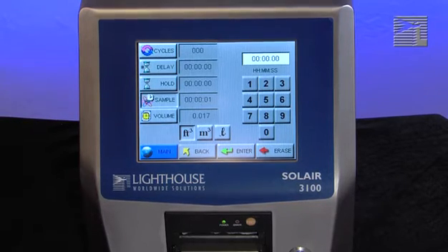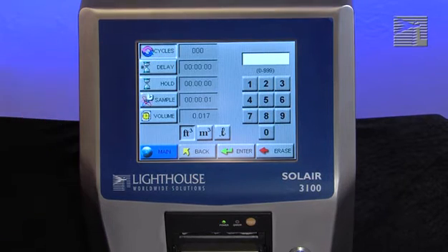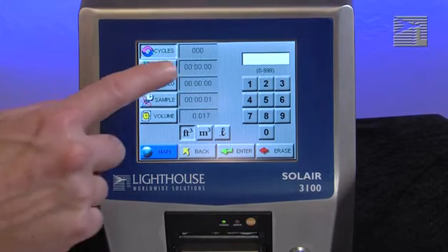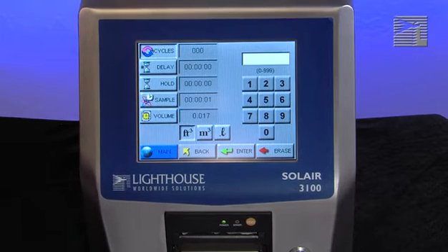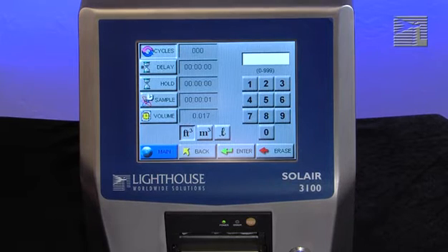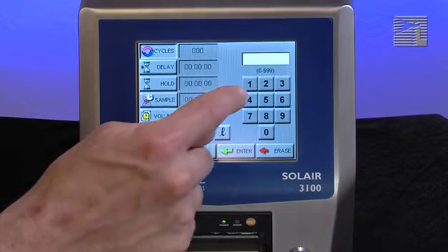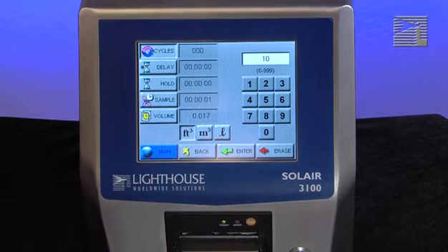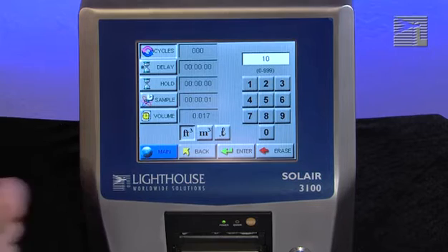The number of cycles is set to determine how many times the instrument samples in a single location. This is used only in auto mode. When cycles is set to zero, the instrument will continue running samples indefinitely until a stop button is pressed. Enter the desired cycles using the numeric keypad on the right. Press erase to erase a number if needed, then press enter to set the cycles.